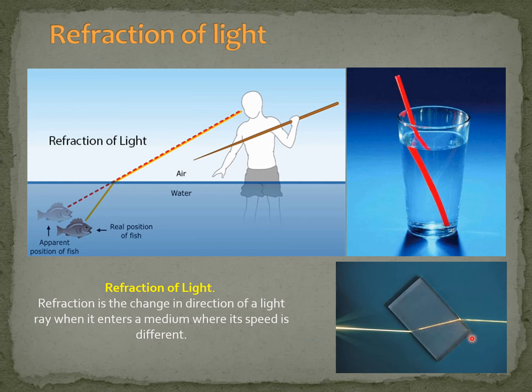So this is an important detail that I will be referring to through the rest of my talk, which is the refraction of light.